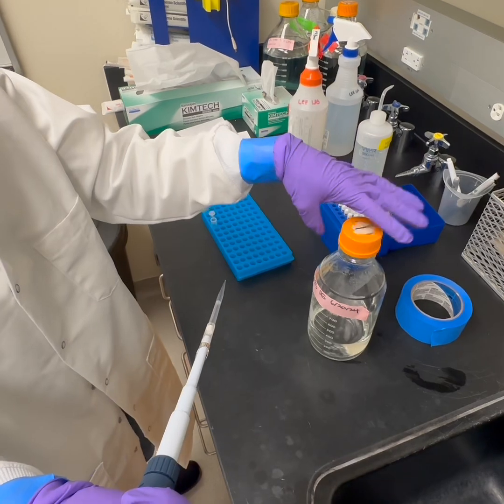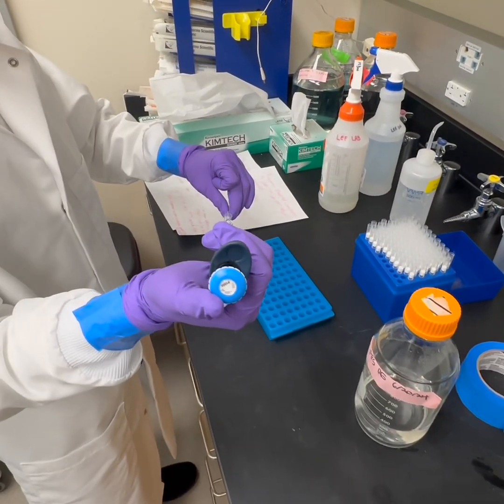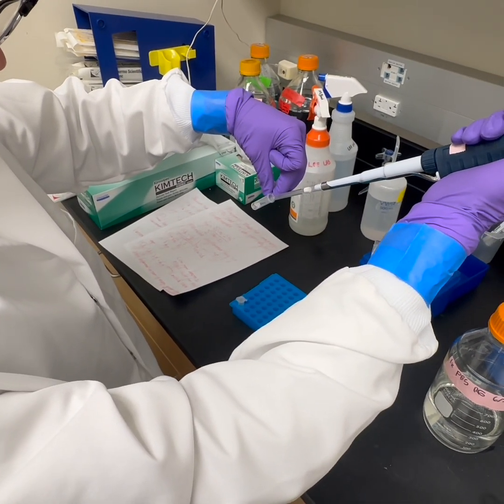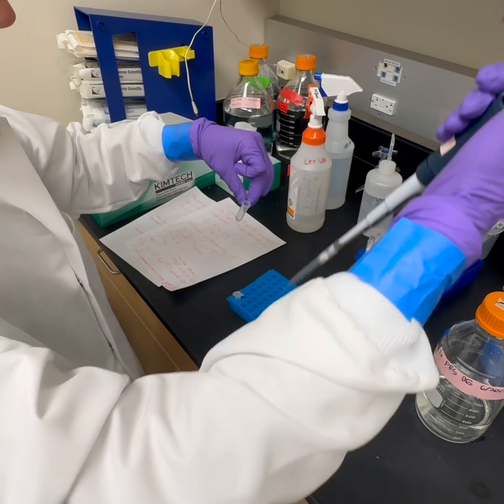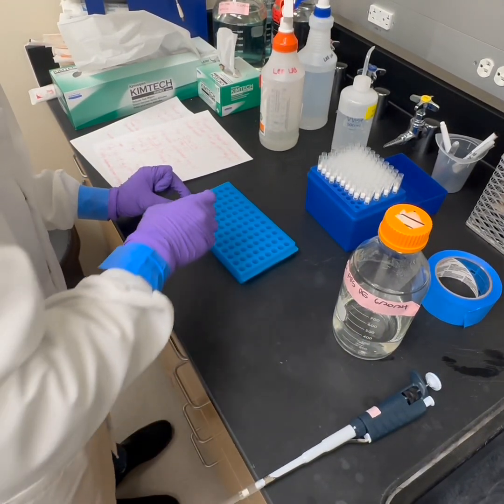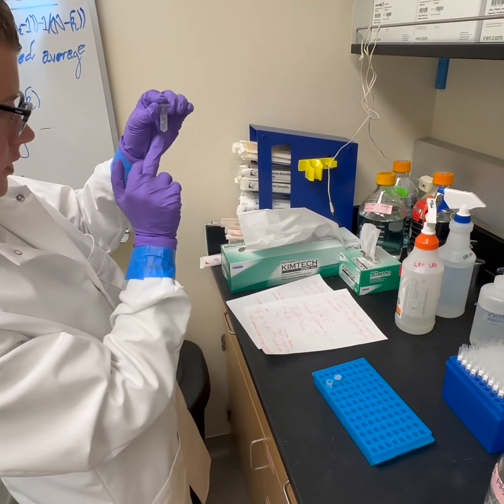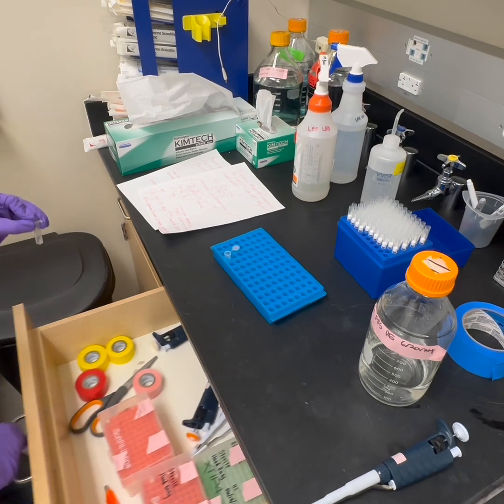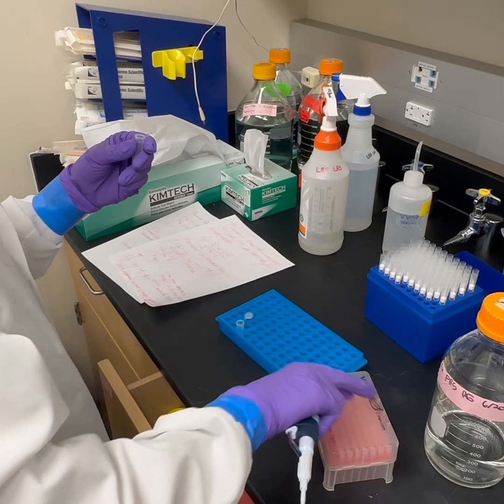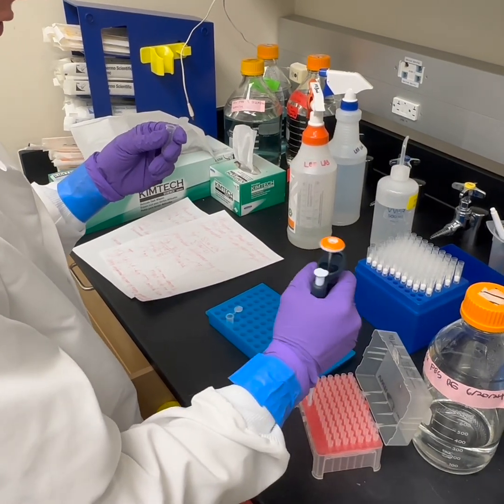You're going to add your larger volume first. I'm just going to add it to the bottom of this. I'm going to keep this pipette for mixing. Okay. Make sure this is mixed up. Now grab your 2 microliters.